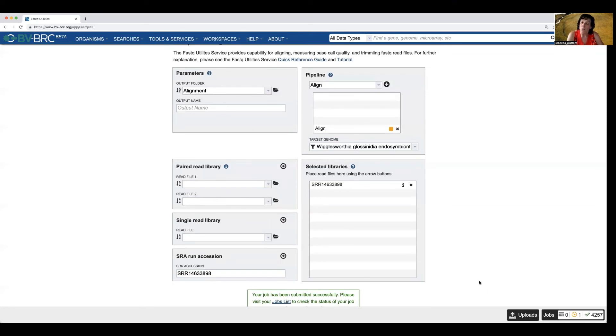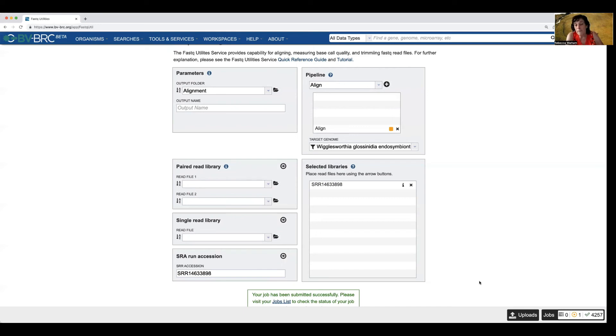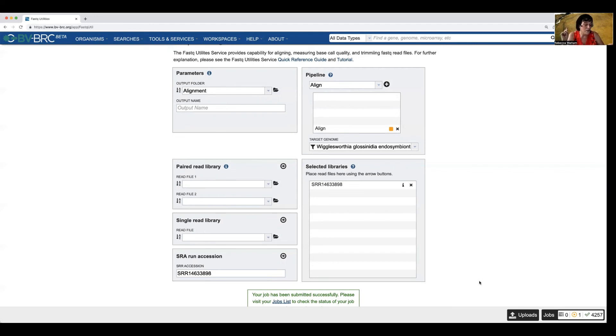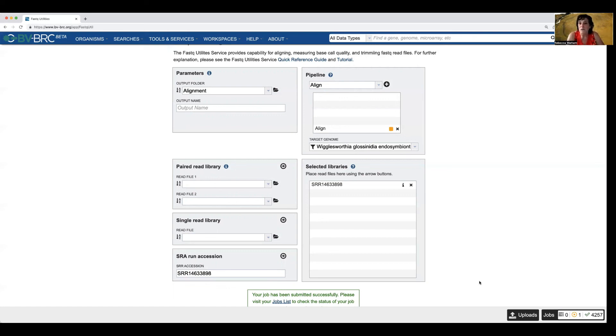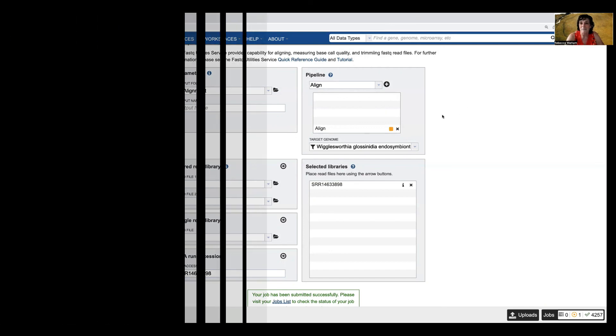And so what we're doing here is we're going to see how many of the reads from the sample map to that particular genome. And then once I have that, I can do a number of things. I could assemble it. I could use it in the variation service. I could use it in RNA-seq. There's a number of things you can do once you have that. Thanks a lot. Bye.